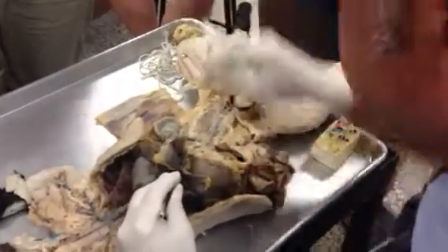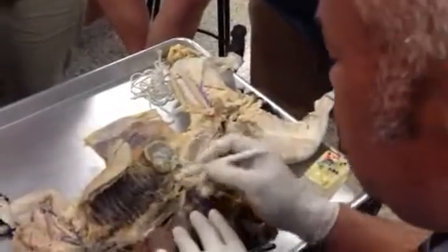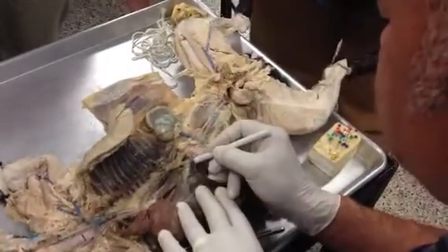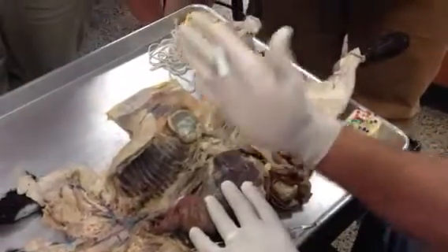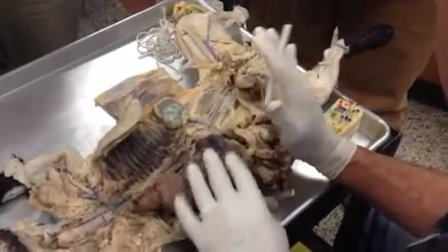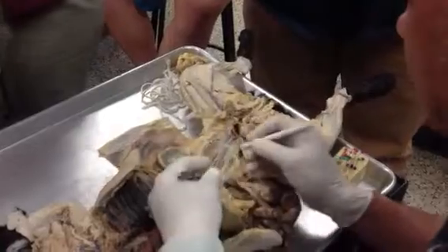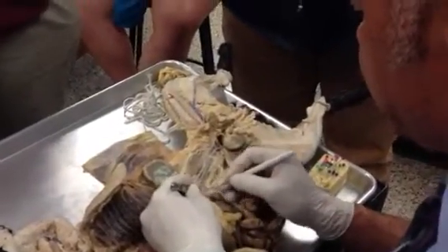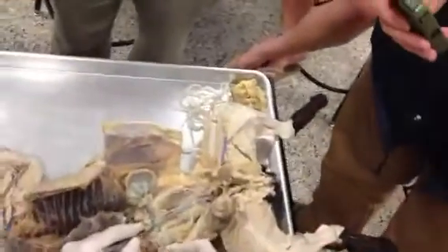Okay, let's take that out of the way. In the thoracic cavity, there is my aorta, thoracic aorta. So what we're seeing in there really isn't much there until we cross the diaphragm into the abdominal pelvic area. Right? So let's do that. So we cross over into the abdominal pelvic, and there is my inferior vena cava right there.